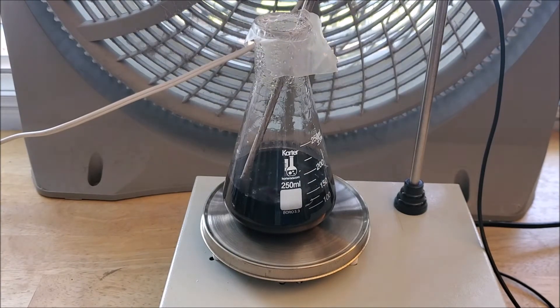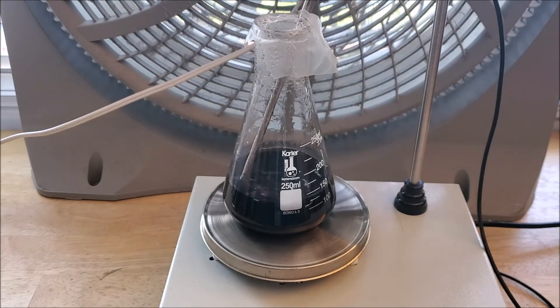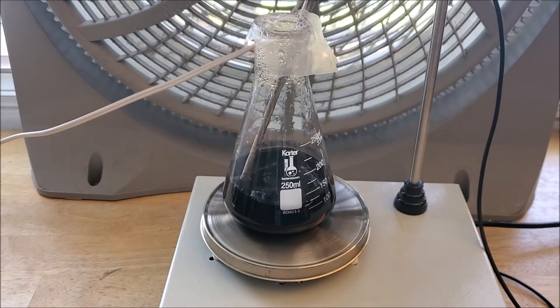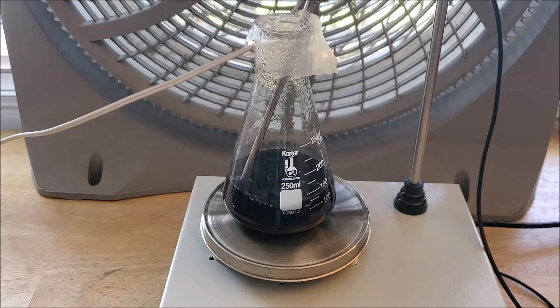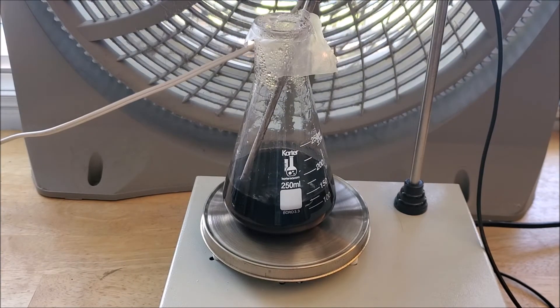The excess ammonia that's produced in the reaction then goes on to bind to the chloride ions in solution which gives us our two major products which is chromium 3 acetyl acetone and ammonium chloride.